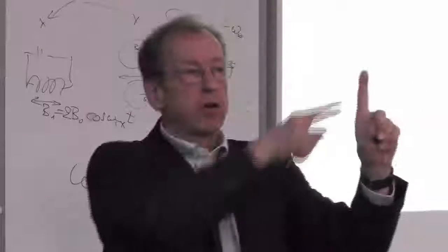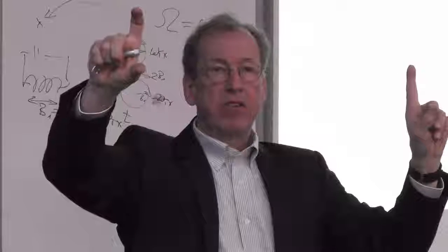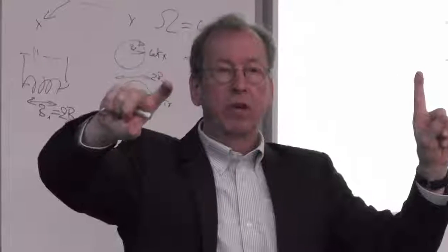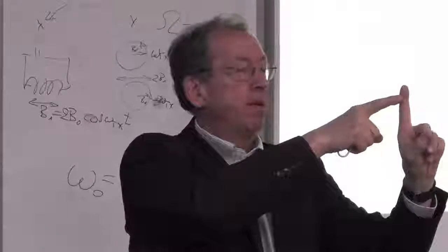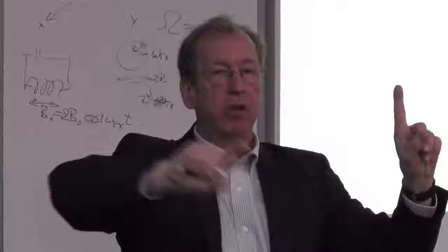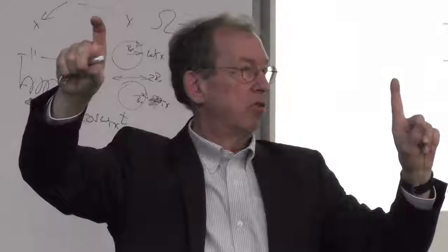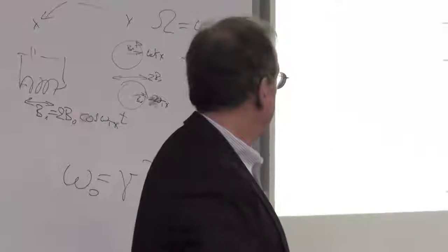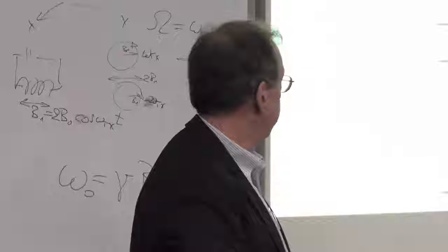Again, you have two spins, but now they're connected by chemical bonds. The magnetization of that spin polarizes the electron orbitals through the chemical bonds, and that spin senses through the chemical bonds the orientation of the other spin. It's called the indirect spin-spin coupling. So we have the indirect coupling through the chemical bond, and the direct coupling, the dipole-dipole interaction.